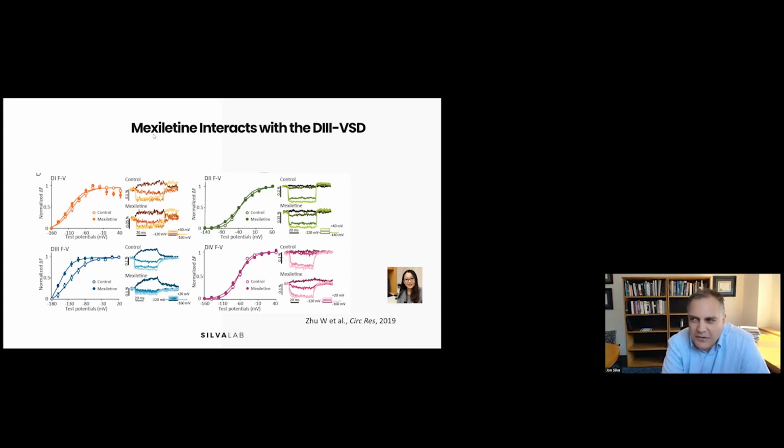I think Baron Chanda's done a little bit of work on that, where they look at a defective channel that has inactivation deficient, and then they can see the different voltage sensors move and contribute. But I think the question is, did they really change how the channel functioned by introducing that variant? I see. Okay, thanks for your reply.